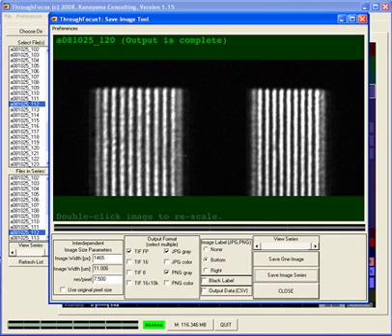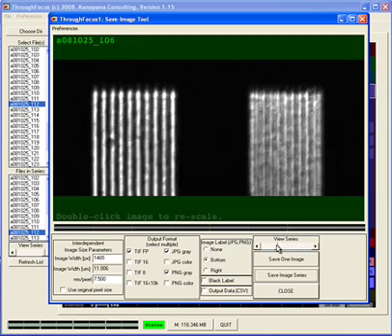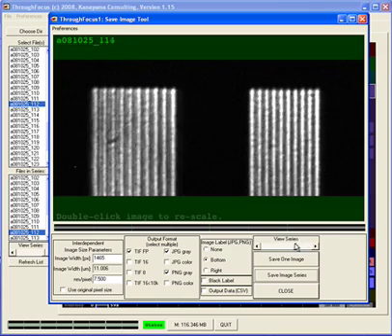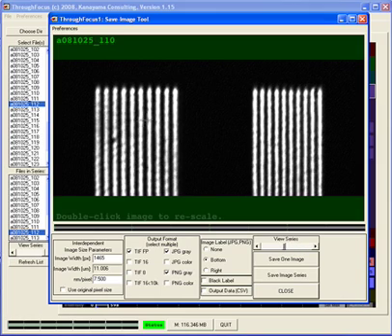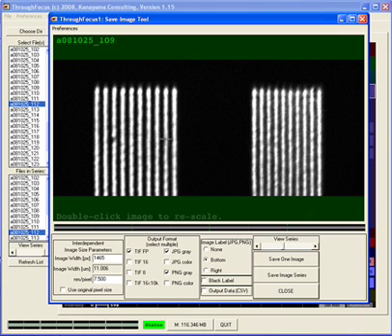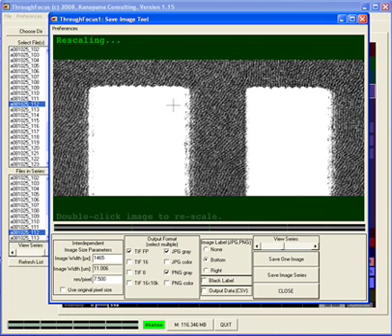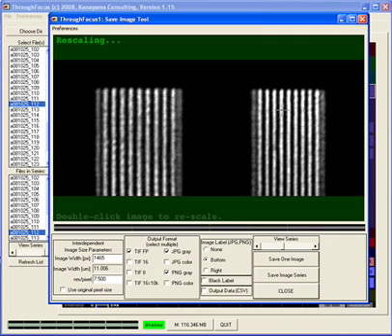Okay. Now once it's done, we can also use this slider to go quickly through the images. You can see that these would be 30s and these are 25s, I think. Now if you're not happy with that, let's say you didn't like the scale, you can double click, change the scaling. Notice it got a little darker. And now wherever you double click, it's going to change the scale. So if I click here on the brightest area, I get a good scale, and now I can save it again if I want, but I'll do that later.